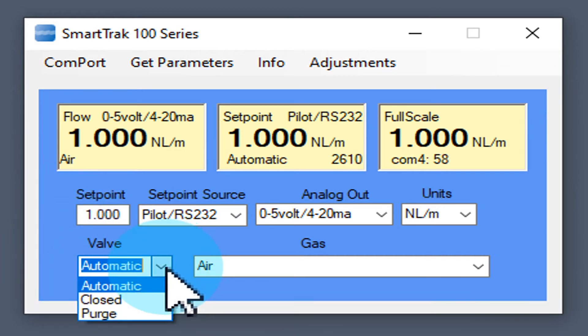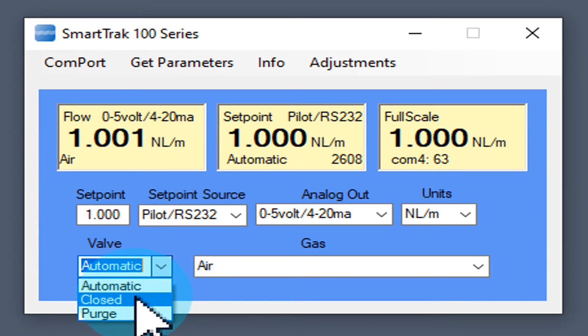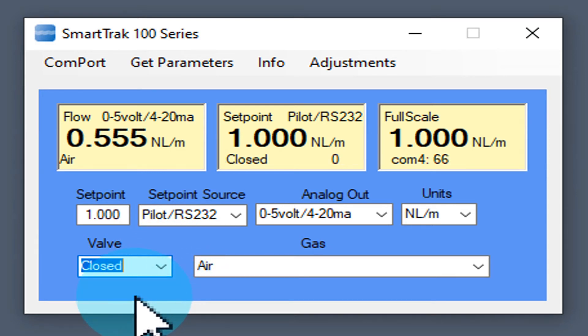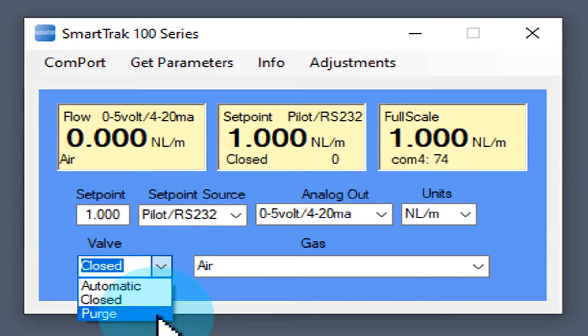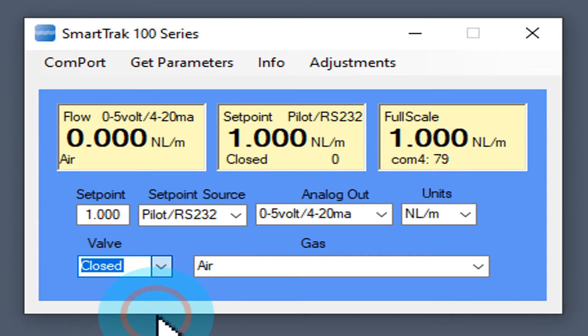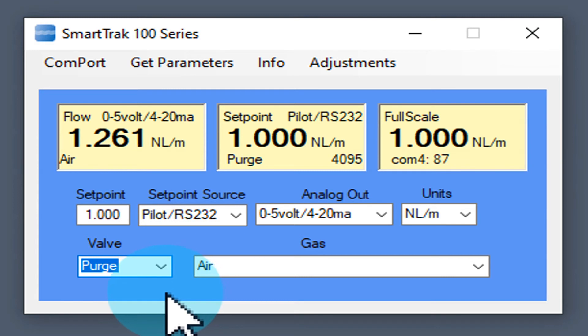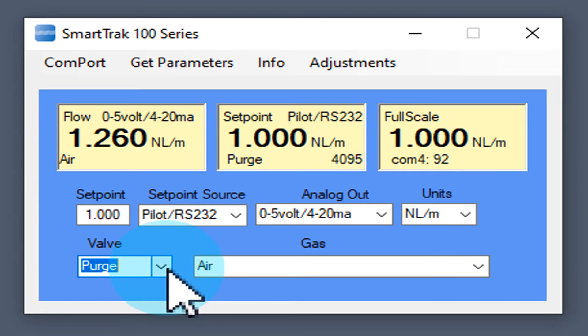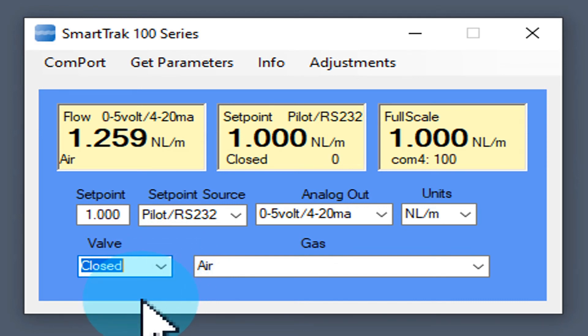You can close the valve manually by selecting close from the valve field. It is also possible to purge the unit by choosing the purge function. The valve opens completely and the maximum flow passes through the unit. The valve opens quickly.